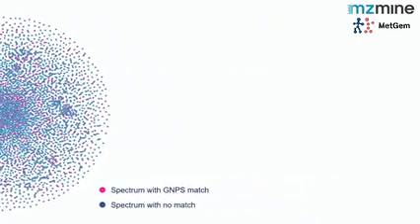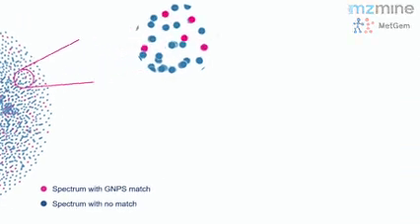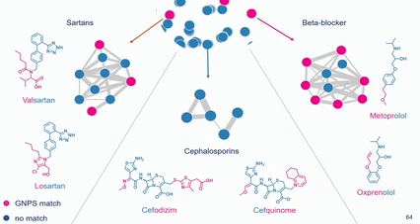And if we look even further into this network, we saw molecular networking in mzmine. What is also very interesting, of course, is that specific compound classes are very well covered in the public domain. So if we see beta blockers, for example, you have something unknown but similar, you would get an annotation and then you could propagate the structure based on this information. Then we have the sartanes, we have less annotation, so fewer magenta nodes, but still you would get an idea about the structure itself, if this would be an unknown cluster. If we go to the middle one with the cephalosporins, no annotation, no ideas, so you would need to do either isolation or try to identify what the structure is in the end.